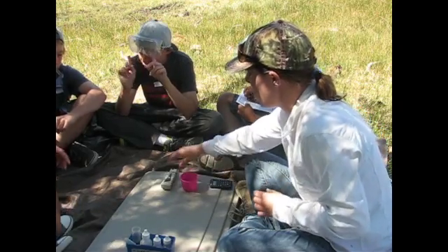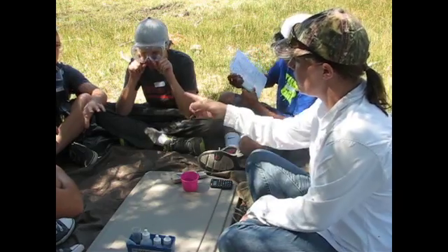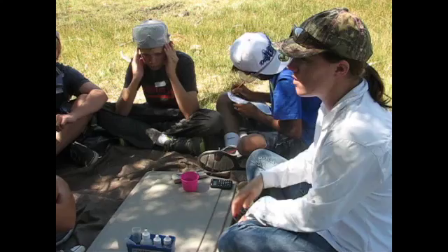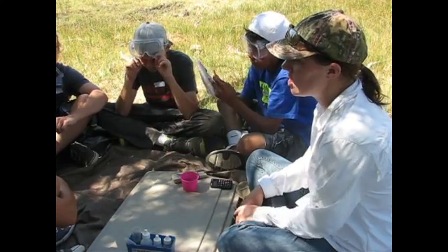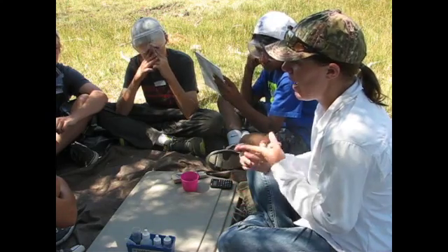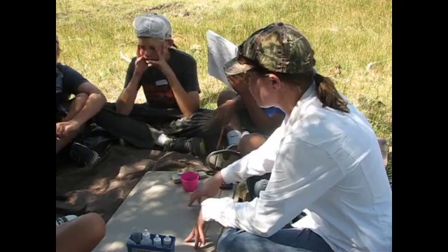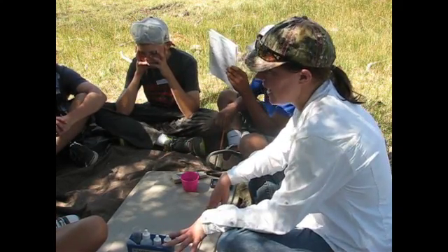Has anybody heard of hard water before? Yes. Do you know how you can tell? When it comes out of your shower head, it makes it like white. Yeah, it's all white. Isn't it how much acid it has in it? That's a good guess. It's actually a measure of how much calcium and how much magnesium is in it. So hard water will cause all that. And we're going to measure for it using a titration.